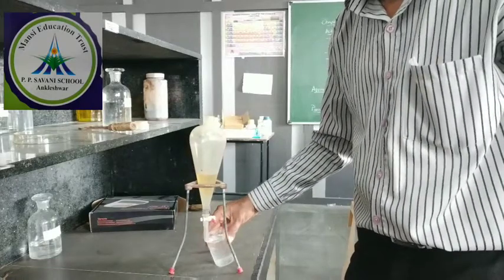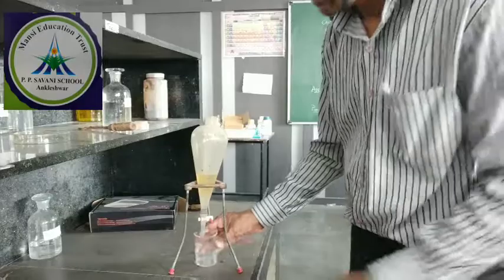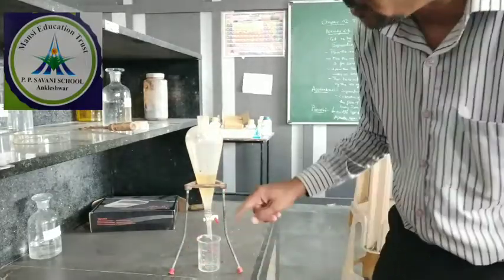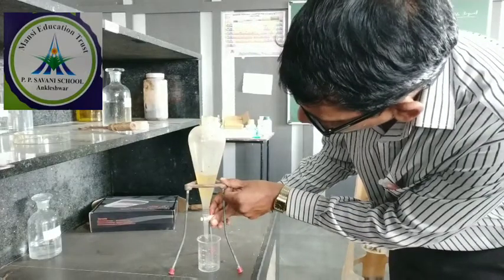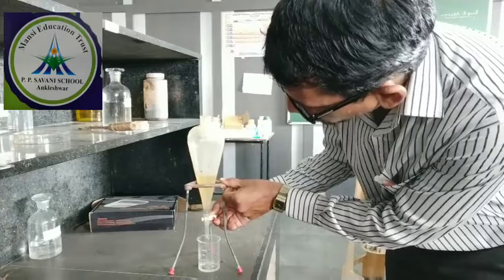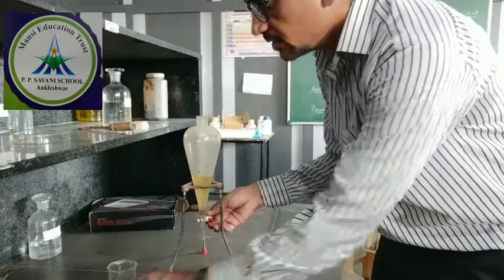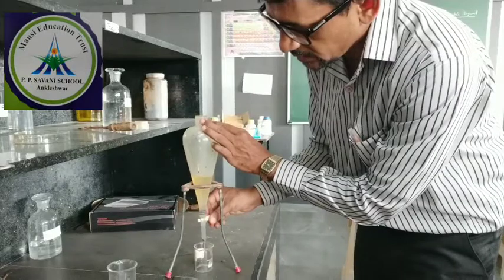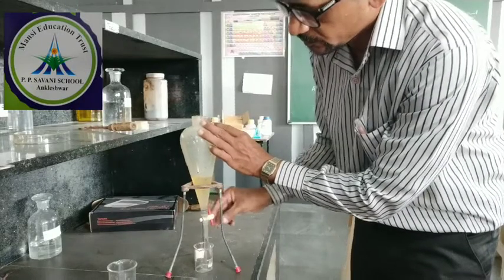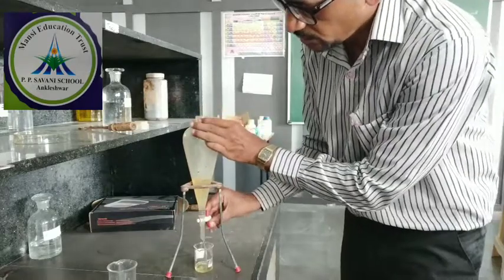Okay, water we have collected in this beaker. When the oil level reaches near the stopcock, then you stop the knob. Now I am stopping, and then I am collecting this oil in another beaker. Open the knob properly.